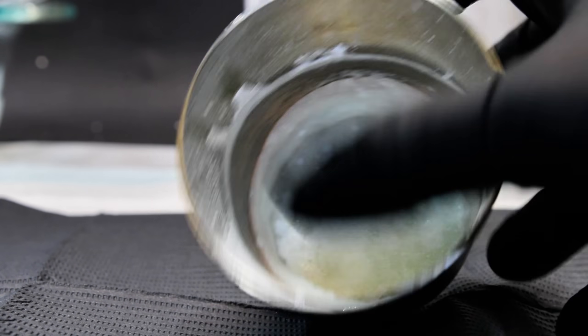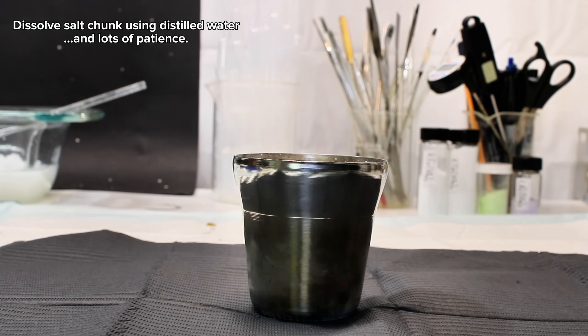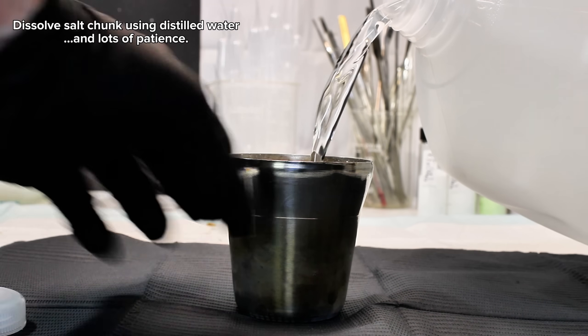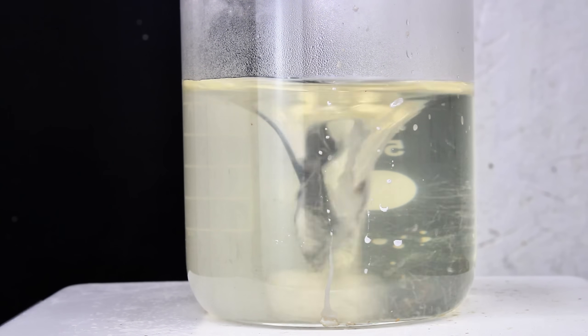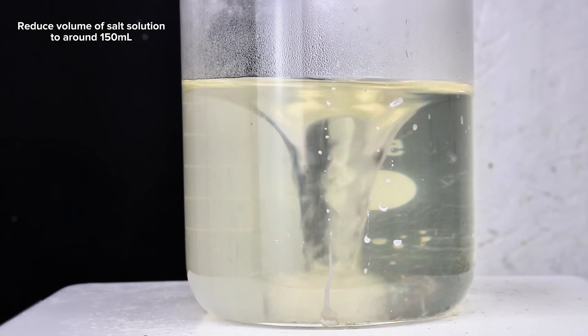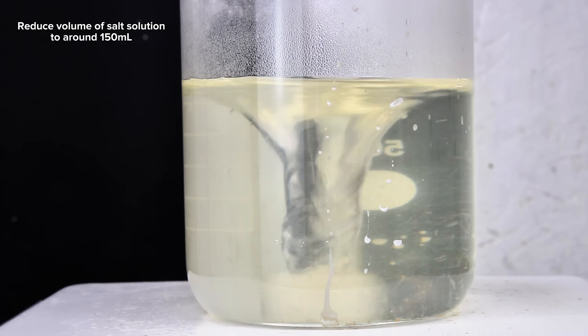Once the salt melt in the steel vessel had cooled down to room temperature, I next added some distilled water and began to slowly break apart and dissolve the fused salt mass. Using hot water for this step will make it far easier as the solid mass of salt has minimal surface area and is very slow to dissolve. Once it did all eventually dissolve, I transferred the solution to a beaker and put it on a hot plate to boil.